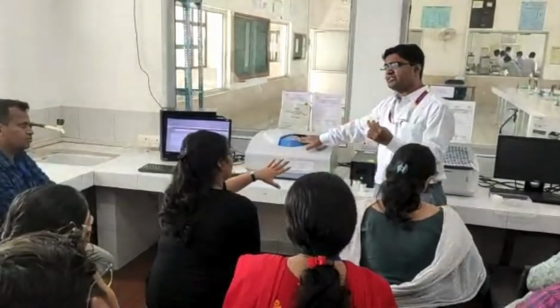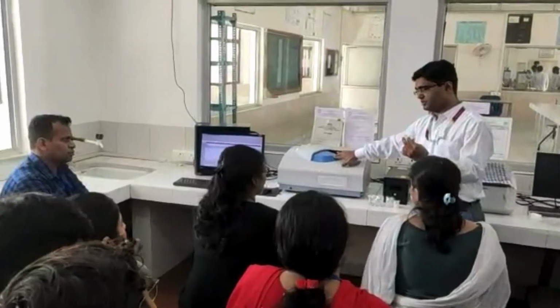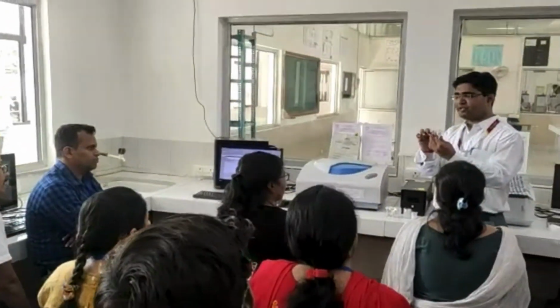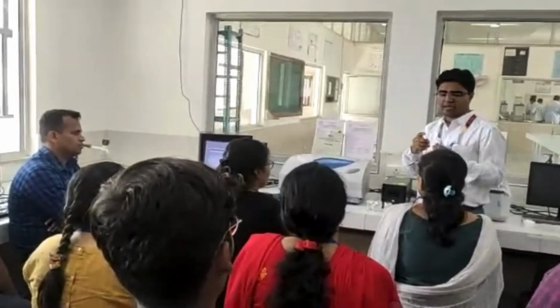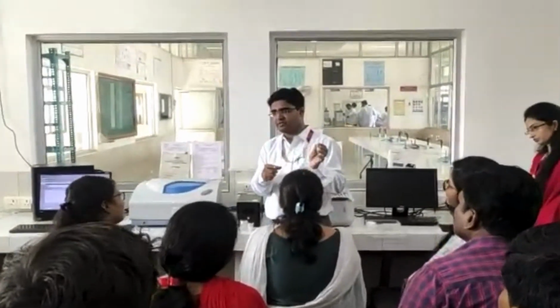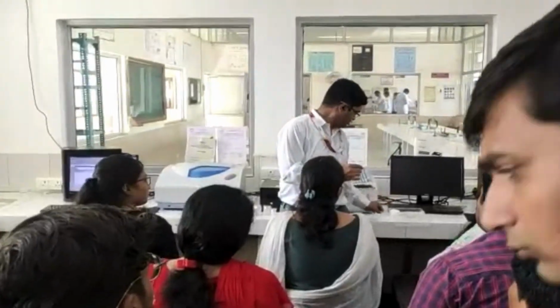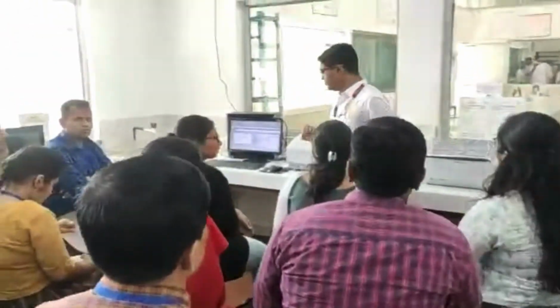So you can put a maximum of 1.5 ml. Yes. And like your UV, the same size will be there. As with your UV, up to 75% or 2/3 you need to fill with whatever your sample is. And here, accordingly, I will show you how to load the sample in this cuvette. Accordingly, you can put the sample for the zeta potential analysis. So one sample you can put.